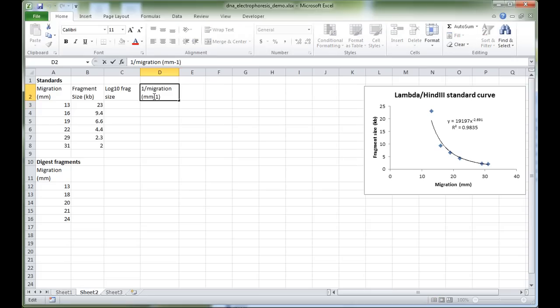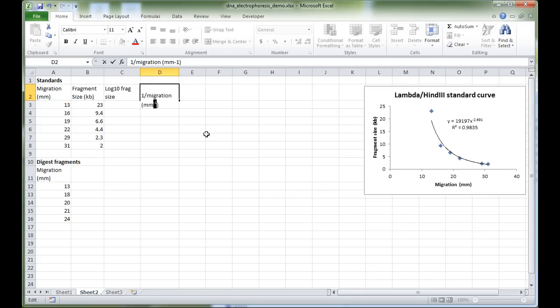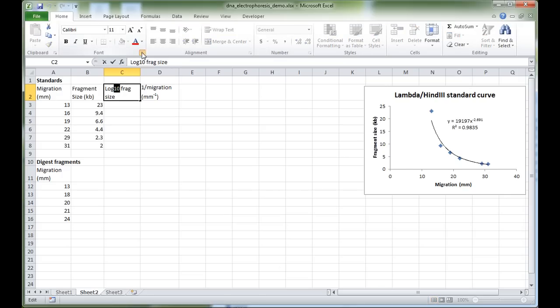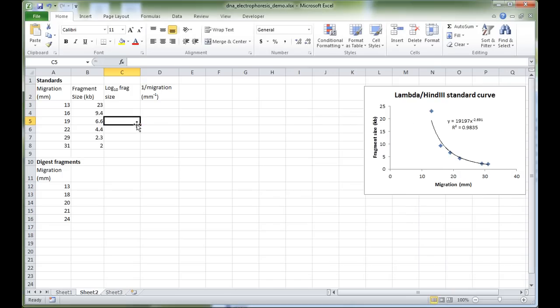To make the superscript, select the text, go to Font, choose Superscript, and click OK. To make the '10' in log₁₀ a subscript, again go to Font, select Subscript, and press OK — just to make the labels nicer to look at.